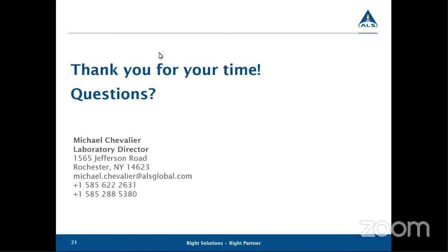What information was used to develop the recommended deployment time? So this was originally based off of just bench studies looking at comparability and recovery rates. It was found, I believe, that they were done with a 7-day, a 14-day, and a 21-day equilibration period. And for the majority of parameters, there was no additional recoveries beyond that 14-day period. The few that there were, which I had noted, some of the explosives and a couple of the dissolved metals, required a little bit longer of a time to get the full recovery.